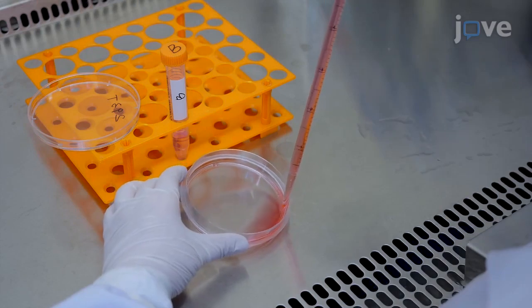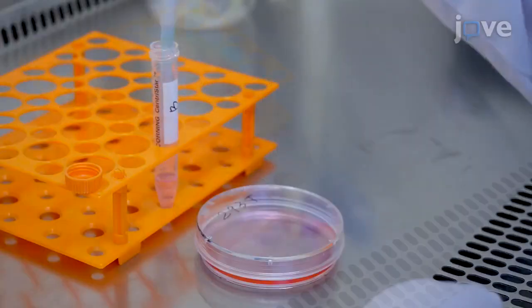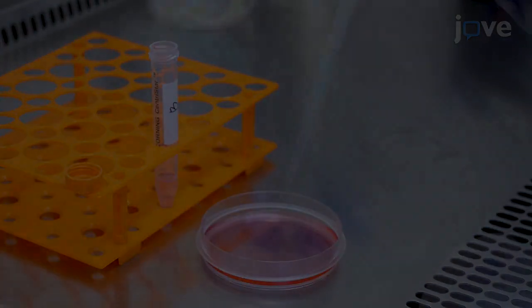Remove 5 ml of medium from the cell culture dish. Then add 5 ml of the lipid DNA complex.